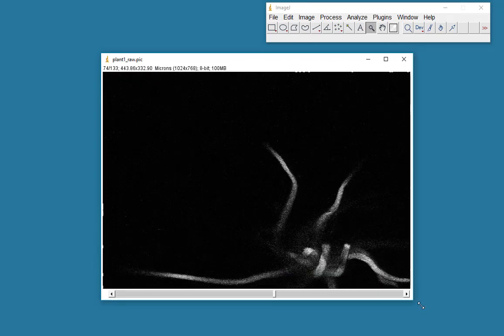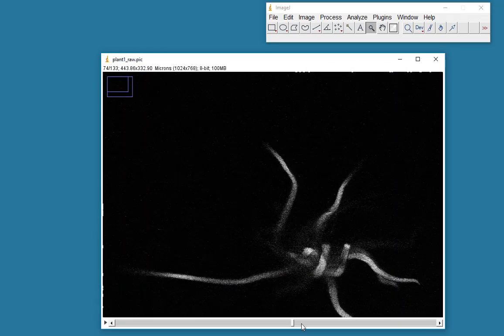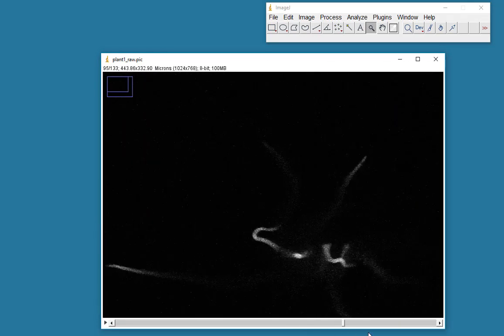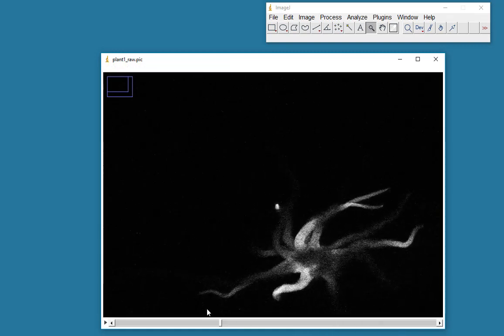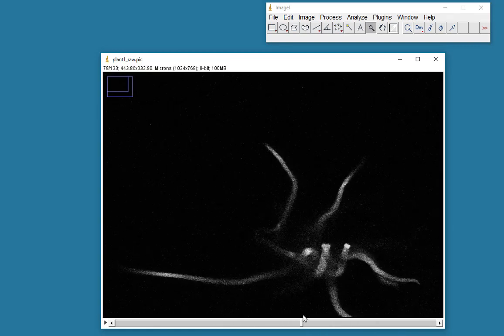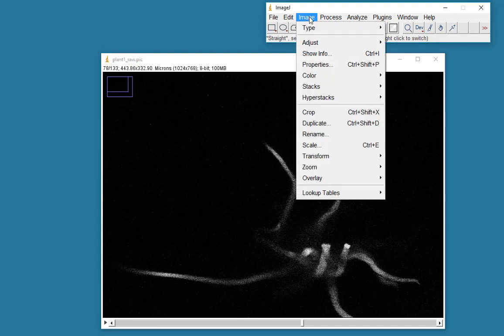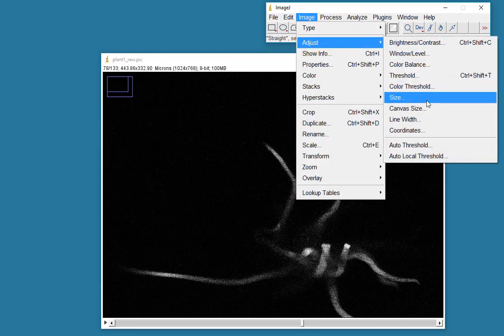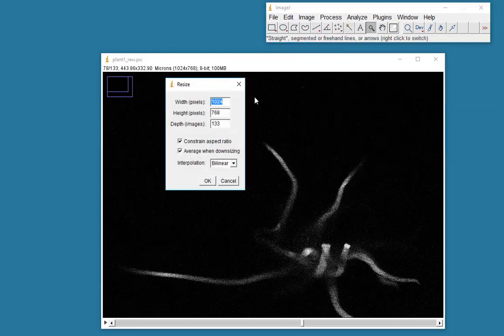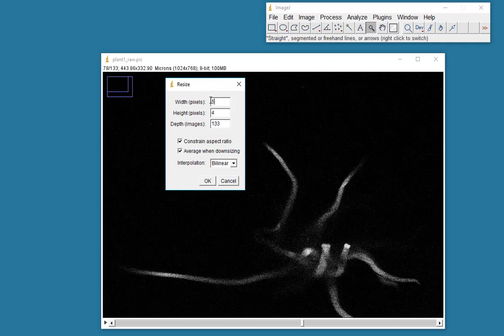I'm going to show you the full image here. It's a nice data set, nice Z series, but it's a little bit too big for the purposes of this demo. So I'm going to change the size here. The width I'm going to make 512.